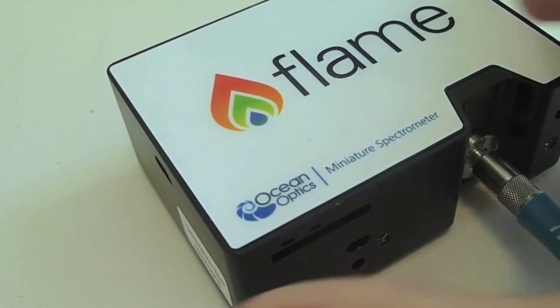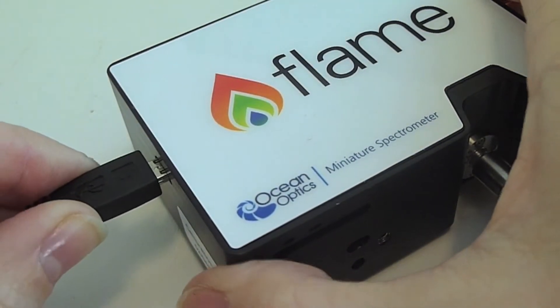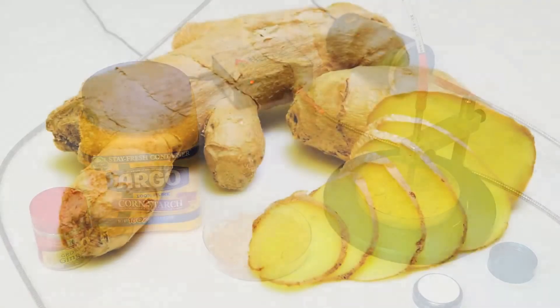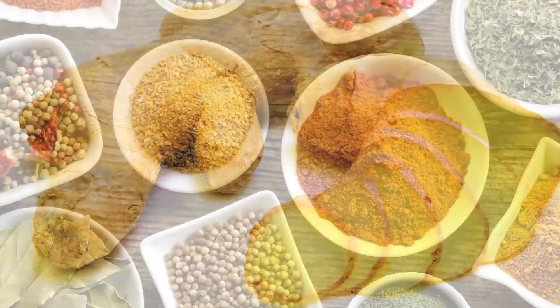The FlameEar is also incredibly easy to use — simply plug in the USB and go. Here we're showing an application of the FlameEar to measure ginger adulterated with cornstarch. Spices are one of the most commonly adulterated foodstuffs.